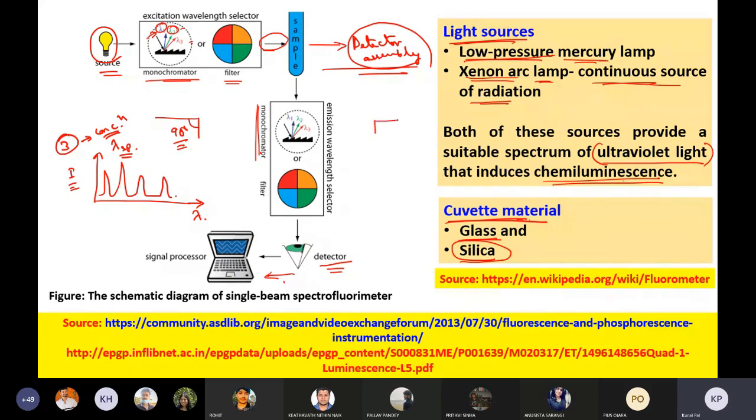Another important thing, I think whether I told you or not in the previous instance, when we are talking of the cuvettes, in the cuvettes from the top view you will be finding this thing. Okay. Now in the case of absorption spectroscopy, as in UV visible spectroscopy, suppose this is the light which is coming in, I0, then you will be having the IT.